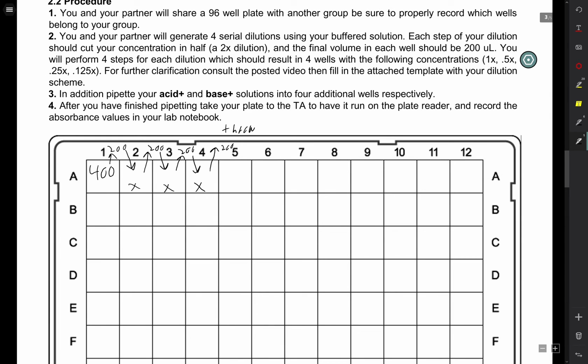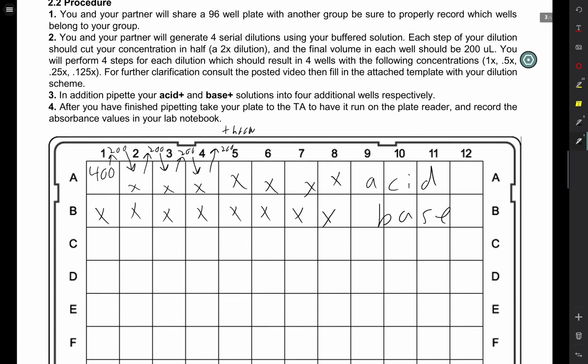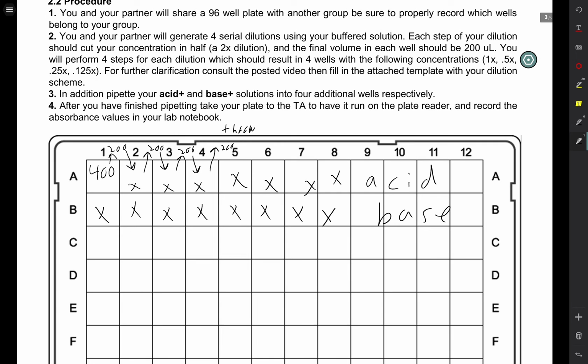Each partner is going to do this twice, so you should end up using all of these wells that I'm marking here. In addition, to give you guys some reference points, we also want you to pipette your acid and base solutions into an additional 4 wells each. After you finish generating these dilutions, your TA will then put it into the plate reader and will read out absorbances for you guys.